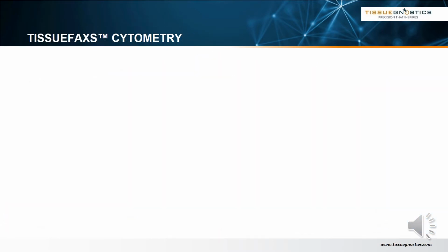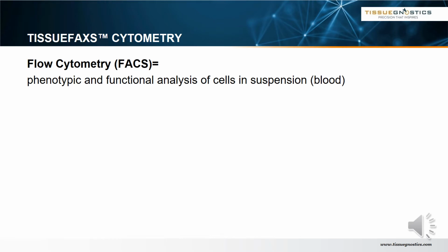You will probably be familiar with flow cytometry, also called FACS, which is a technology that has been available for decades. When you go to PubMed and search for FACS or flow cytometry, you literally get thousands of papers that have been published over the decades using this technology. It offers a phenotypic and functional analysis of cells that have been stained with antibodies conjugated to fluorochromes. A major limitation of this technology, however, is that it can only be applied to cells in suspension.